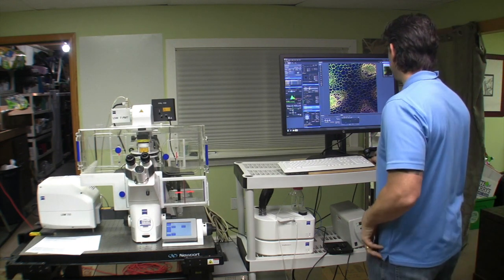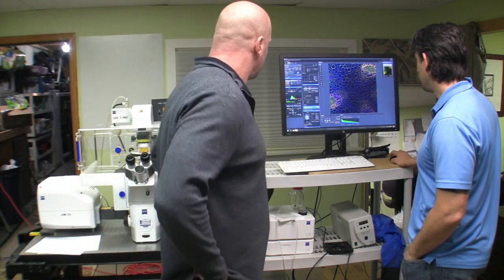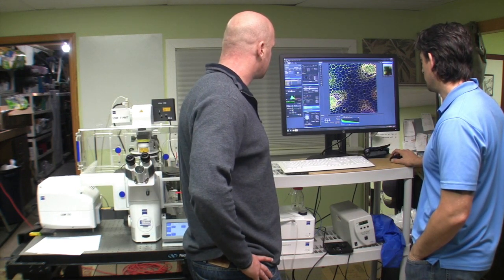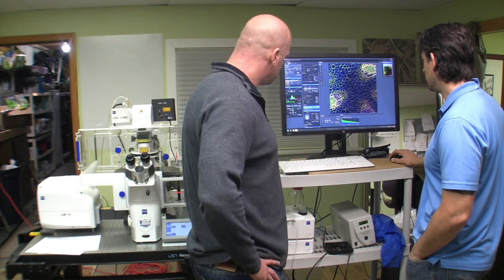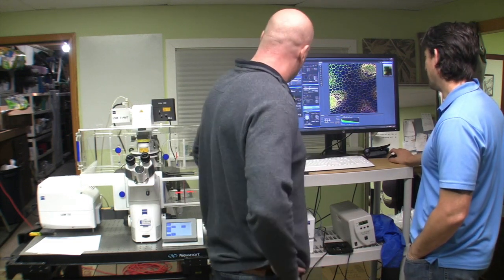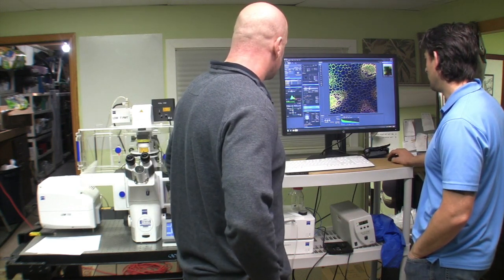All right, all done. So then, if I just do this, you can see that's how it went through. Now it's showing us the slices. Fascinating. So what are these little spots in the center? I'm not sure. They could be some kind of nuclei. I'm pretty sure, nuclei of some sort.